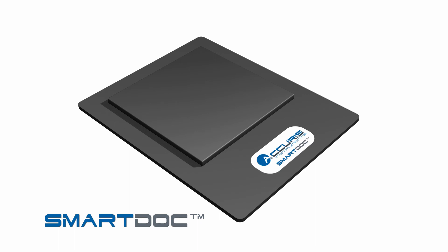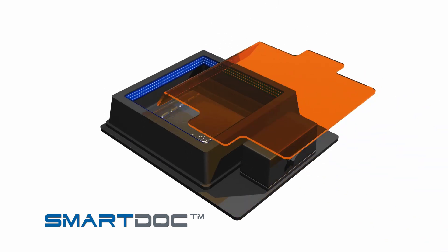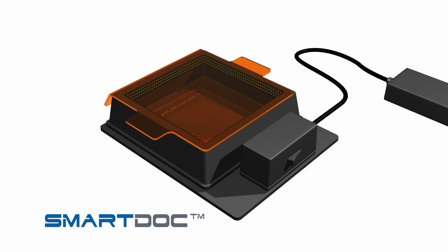After running and staining your electrophoresis gel, place the gel onto the center of the gel platform. Fit the blue light illumination base and orange filter cover on top of the platform. Connect the included 12-volt power supply and press the power button.